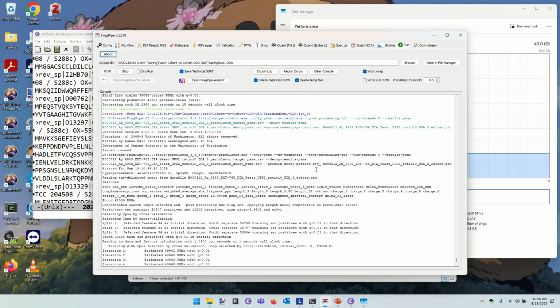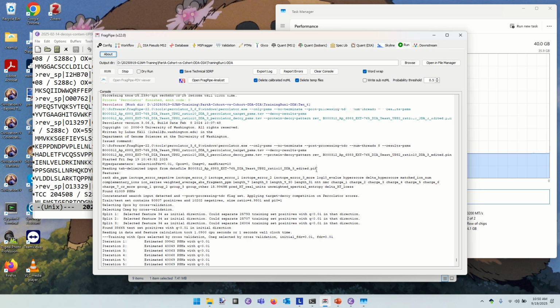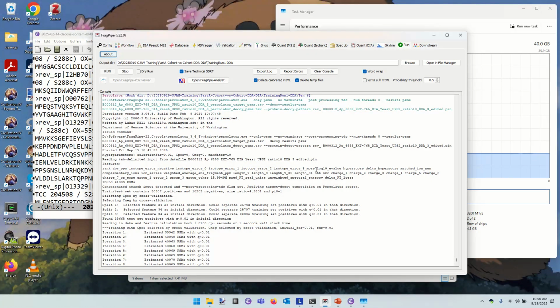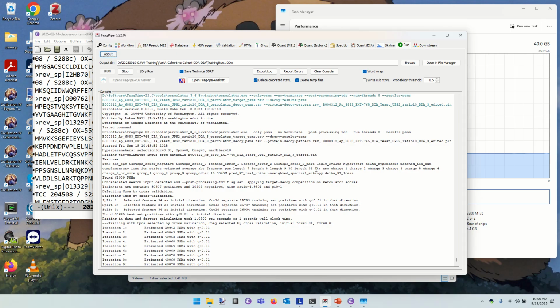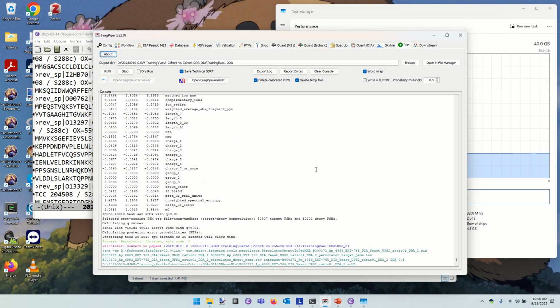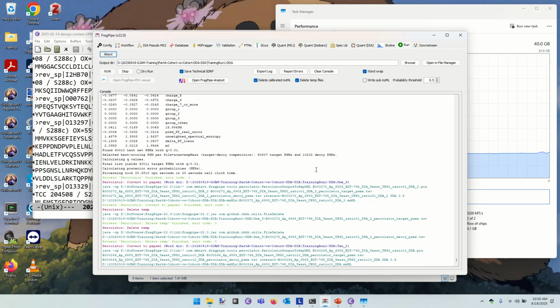But I would point out that this is a little challenging because our data are spread across 6 experiments. The same peptide may be observed in any of those 6 raw files or 6 LC-MS experiments.